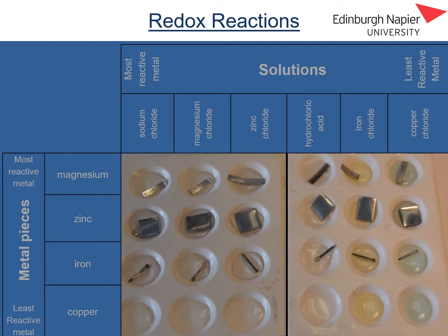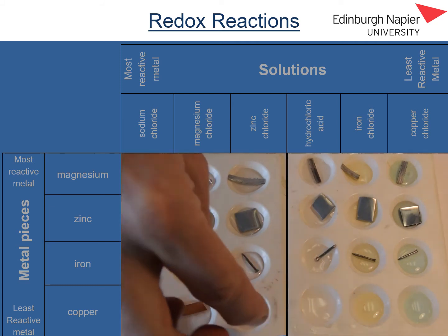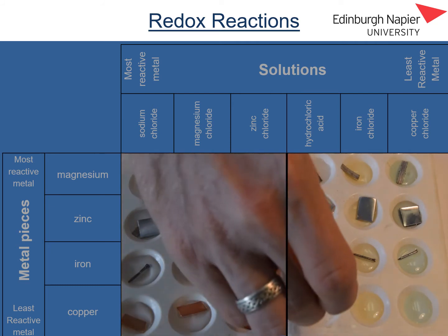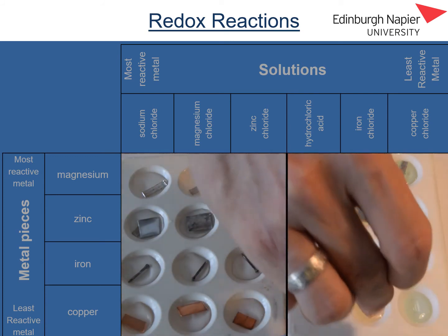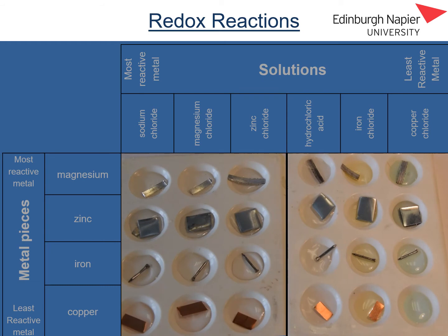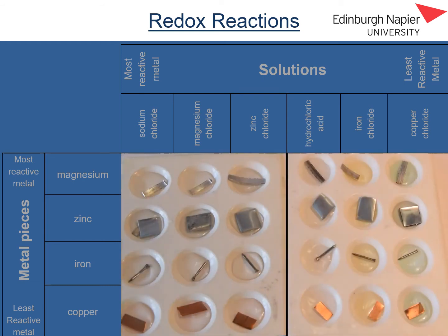In the final row I'm going to add some pieces of copper metal. A piece of copper in the sodium chloride solution, then copper in the magnesium chloride solution, in the zinc chloride solution, in the hydrochloric acid solution, in the iron chloride solution, and finally in the copper chloride solution.